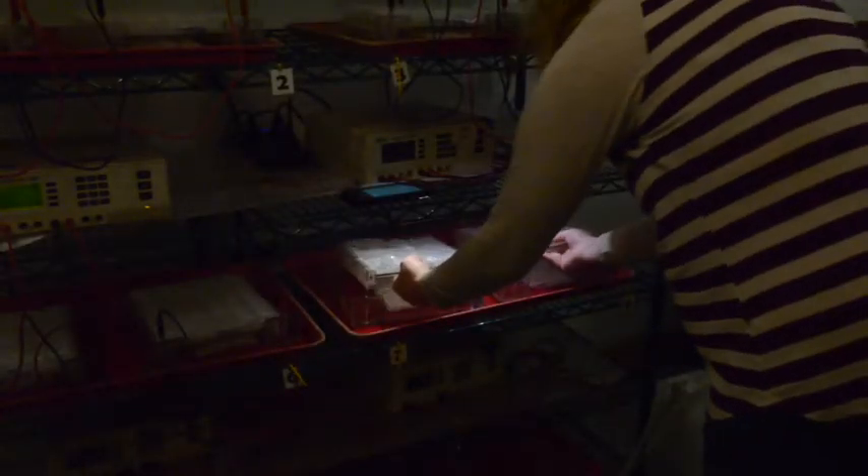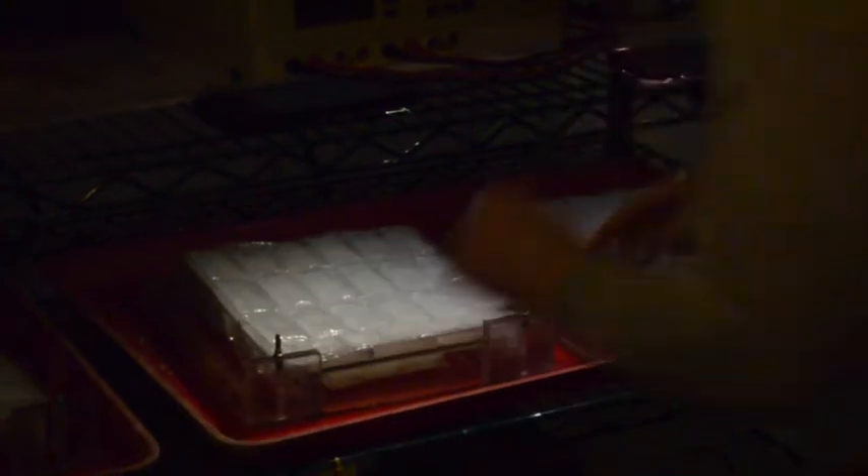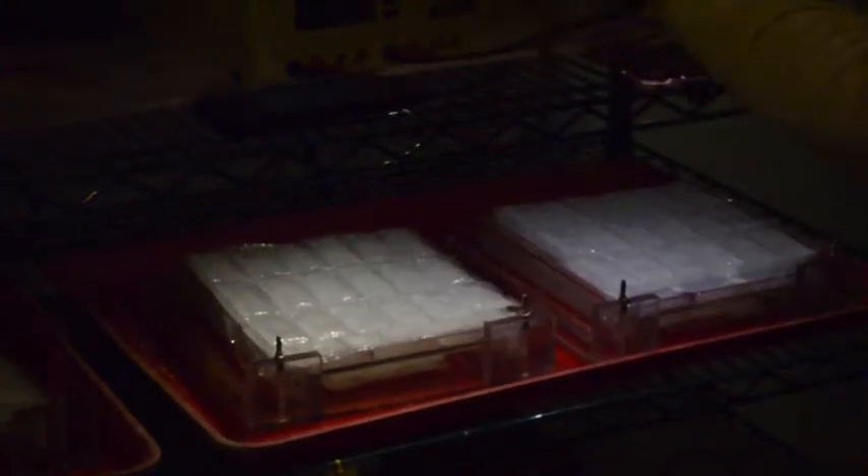Gels are placed in a buffer solution on the electrophoresis machine for several hours in the cold room. We place ice packs below and above the gel to prevent the gel from overheating and denaturing. While the gels are on the electrophoresis machine, the electric current pushes the proteins across the gel. The migration rate is based on the net ionic charge along with the molecular size and shape of the proteins.